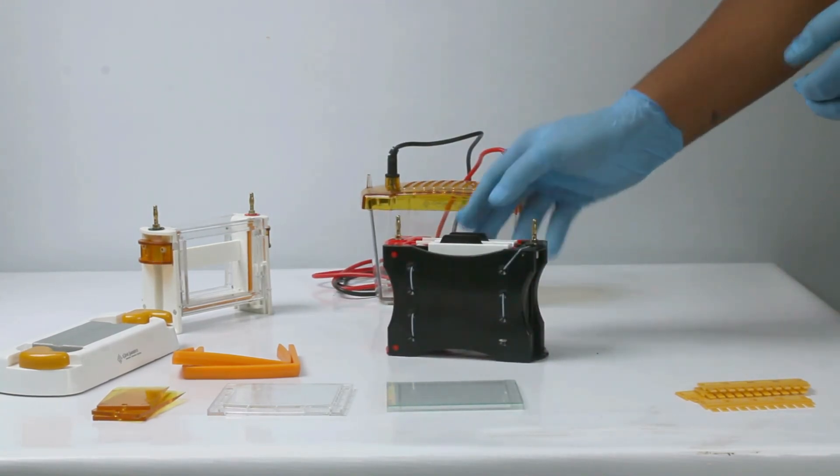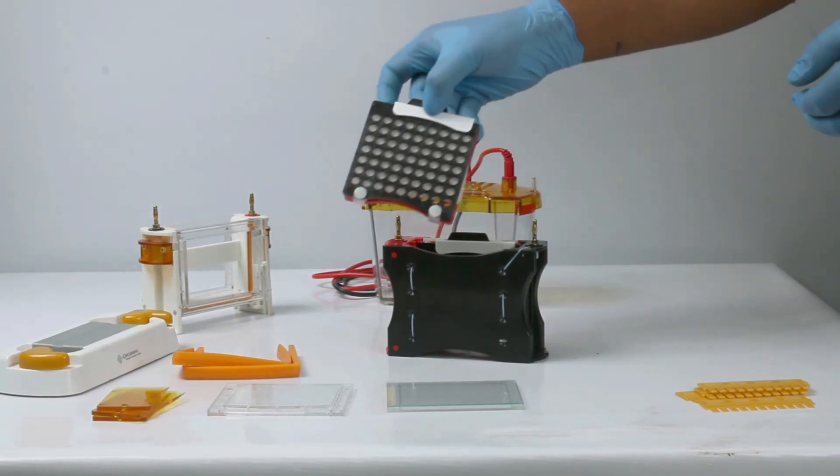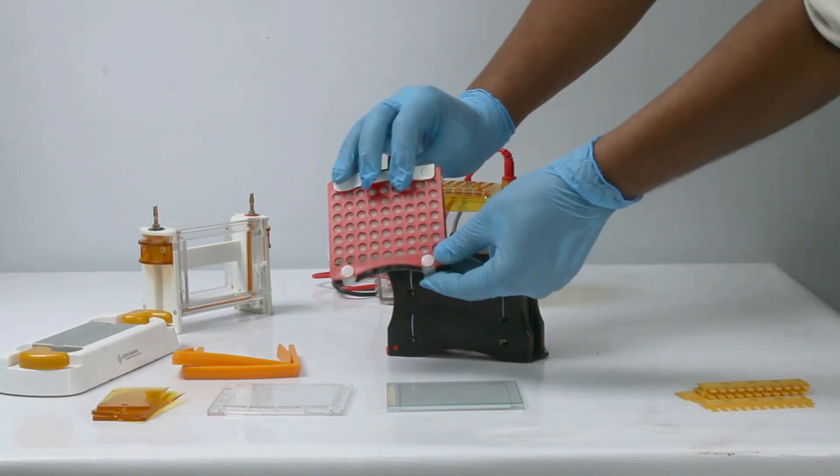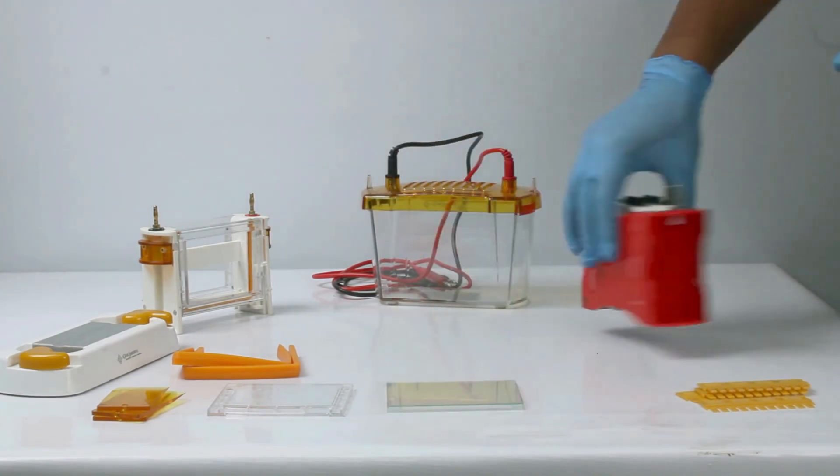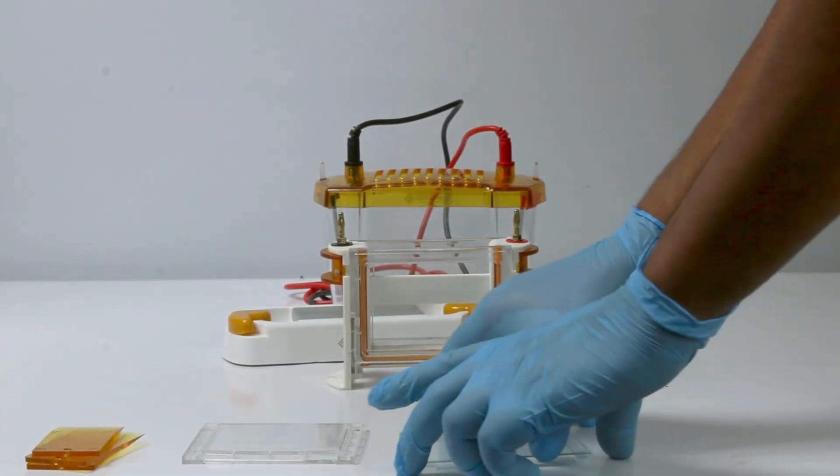This is our western block which is featured with color-coded marking. Black indicates negative side, red indicates positive side. Let us demonstrate the gel casting procedure.